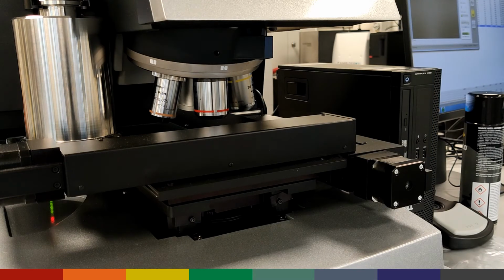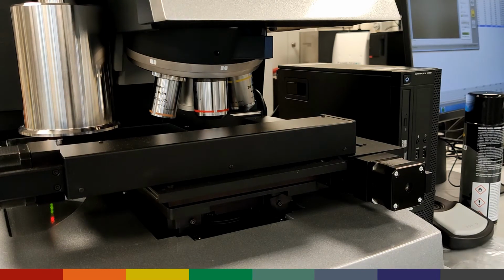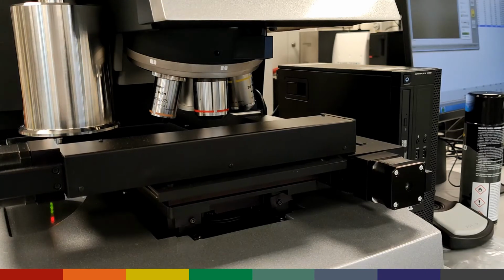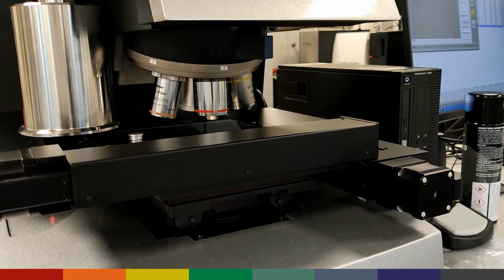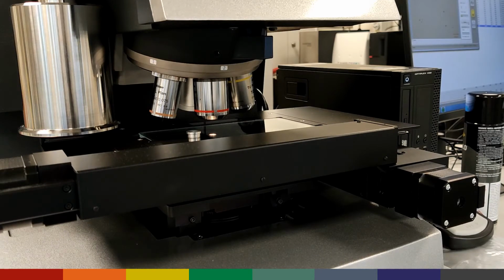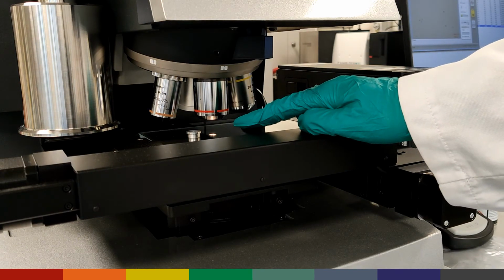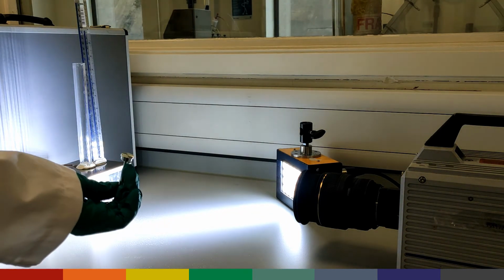Having a knowledge of the size of the particles sticking on the SEM stub prior and after the impact is very useful. As I mentioned earlier, bigger particles would fall off and the smaller ones would stay. Therefore, the first thing I would do after the dispersion is to measure the size of the particles that are sticking on the SEM stub. Again, that can be done using the Morphologi G3. Once the size measurement is done, all we need to do is to drop the SEM stub into the hollow tube, the way I showed you earlier.